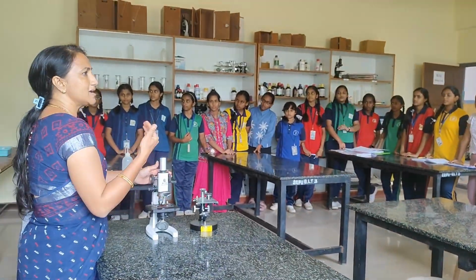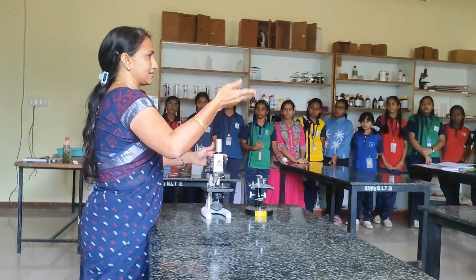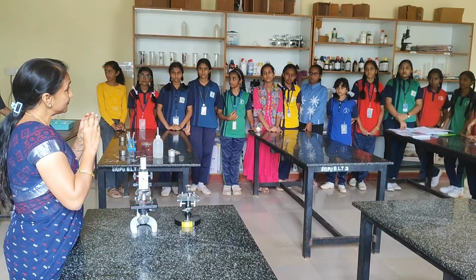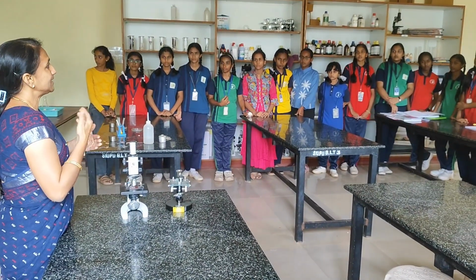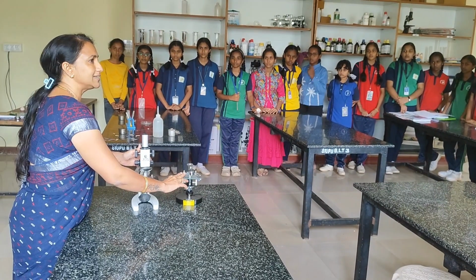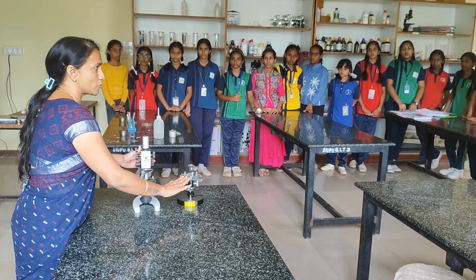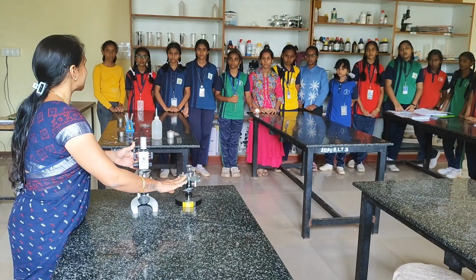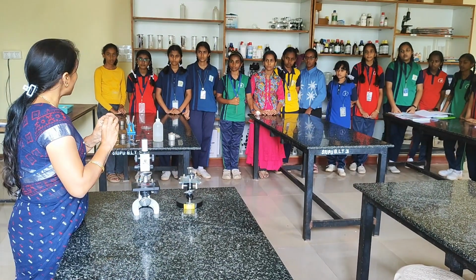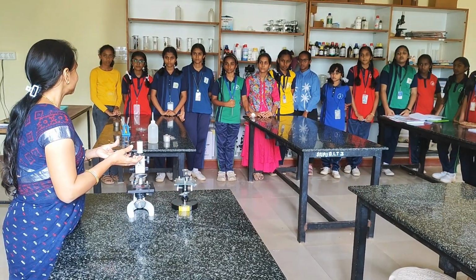Simple microscope. Microscope went on evolving. First, Anthony van Leeuwenhoek discovered a very simple microscope. Then later on, this microscope was discovered and given the name simple microscope, where we can see large things under this. Okay? But this helps us to see more minute things.